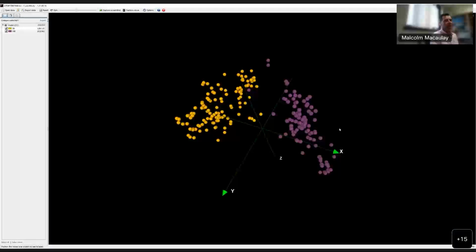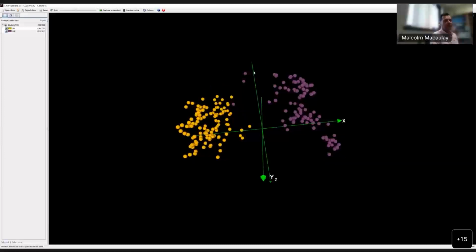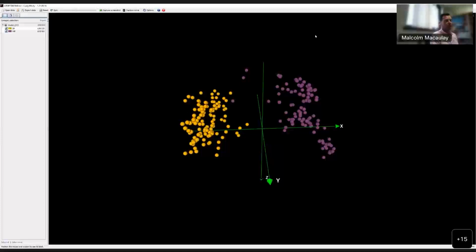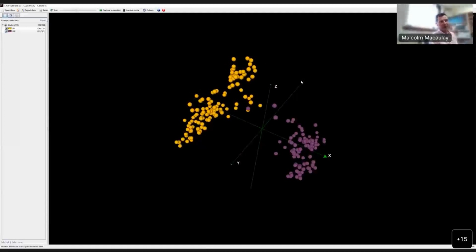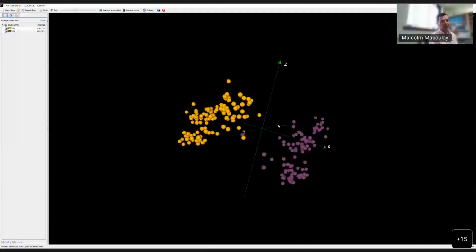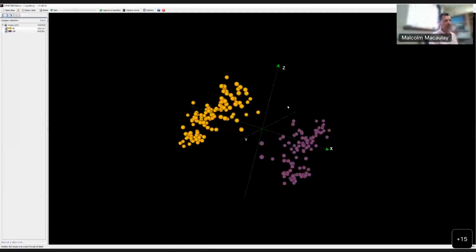That's it. Excellent, thanks. Yeah, so we have our data split into two, where we've got spring barley on the left and winter barley on the right. And Curly Whirly allows you to rotate the axis if maybe you've asked for more different points on your plot. It's a cool feature to be able to visualize your data.